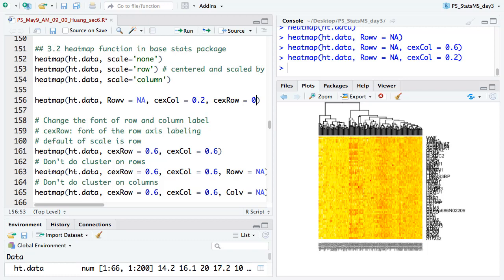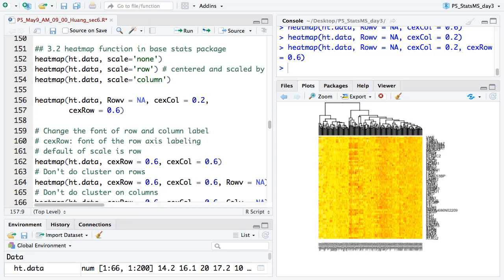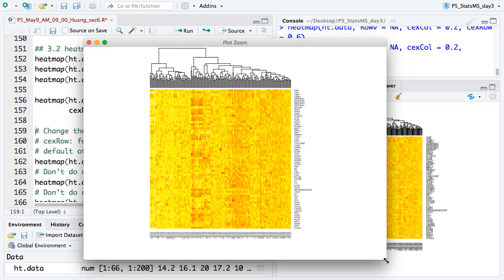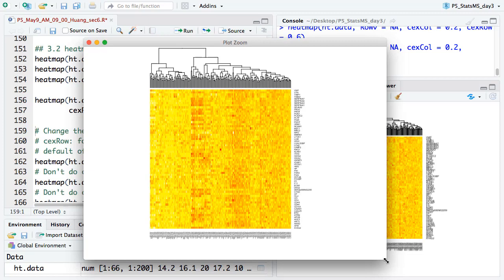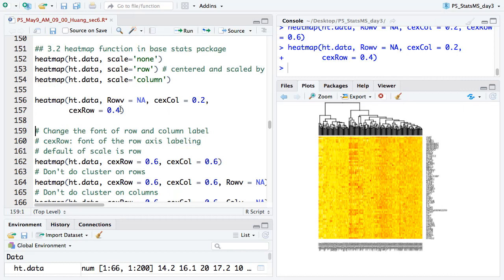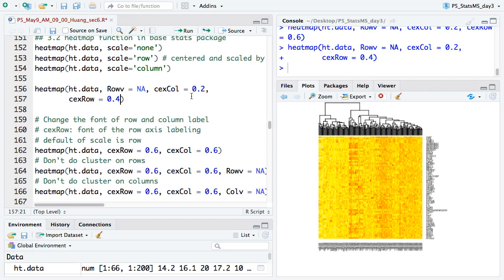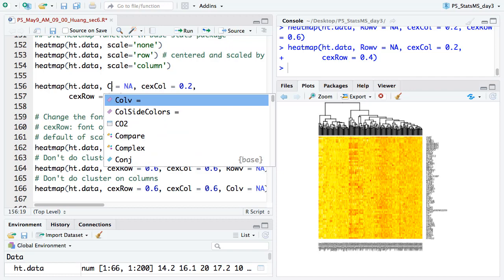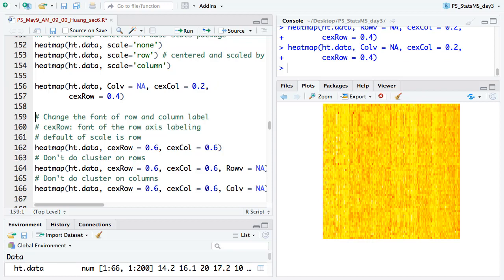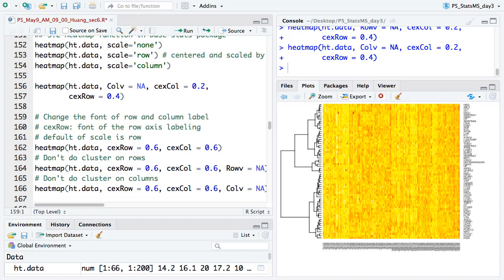We want to validate whether the cluster from the heatmap matches the actual condition labels. The label information is in the annotation data frame we generated earlier. We create a color vector: first set all samples to blue, then for samples from the CRC group, change the color to red. So red means colorectal cancer and blue means healthy. We give this color vector to the heatmap using the ColSideColors parameter.